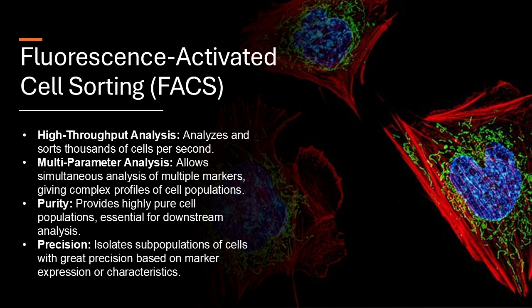So this is really crucial for understanding how our immune systems work, right? And for diagnosing diseases, immune-related diseases, and developing treatments, targeted therapies. So, how exactly is FACS being used to understand and treat diseases? Well, take cancer research, for instance.